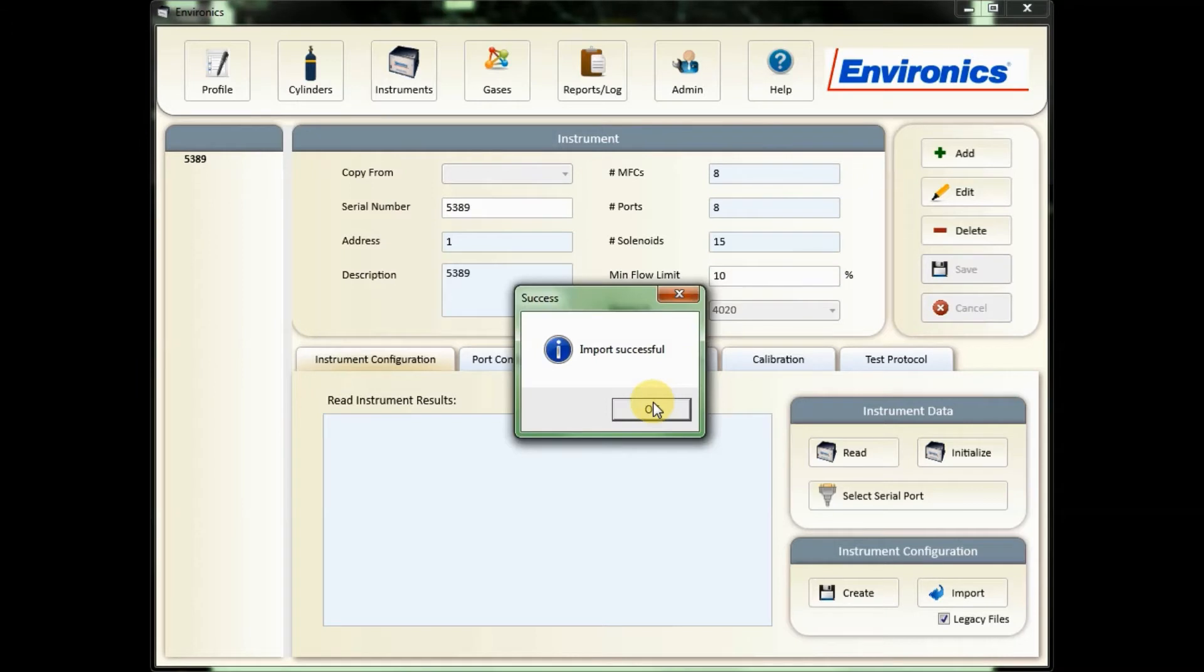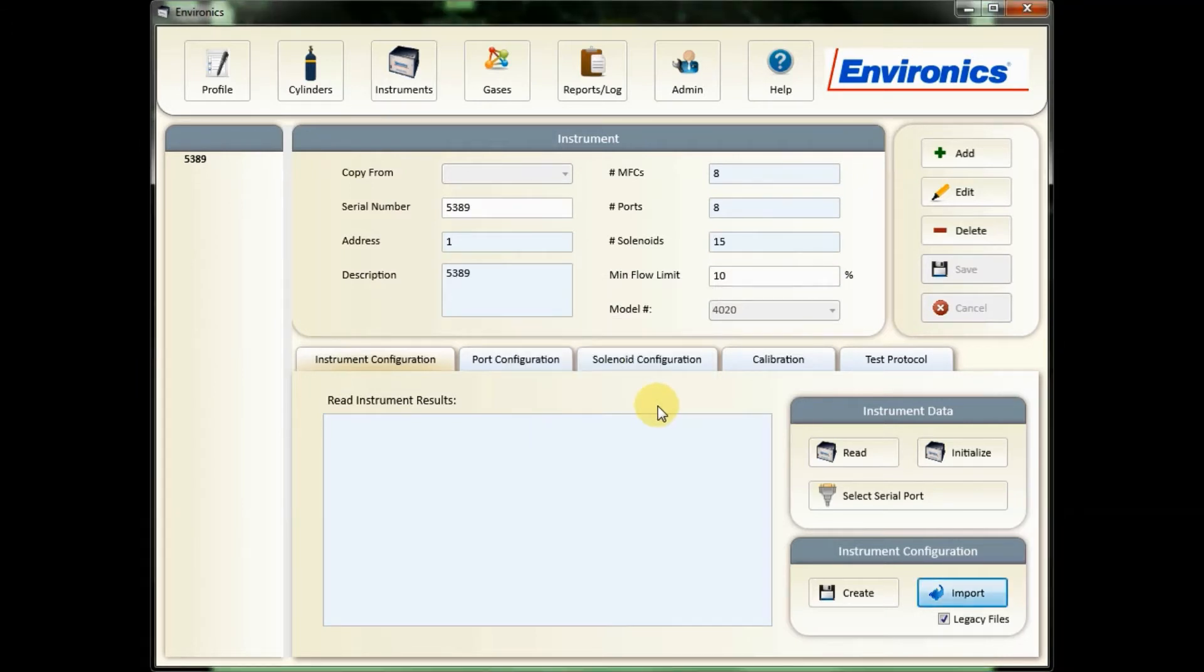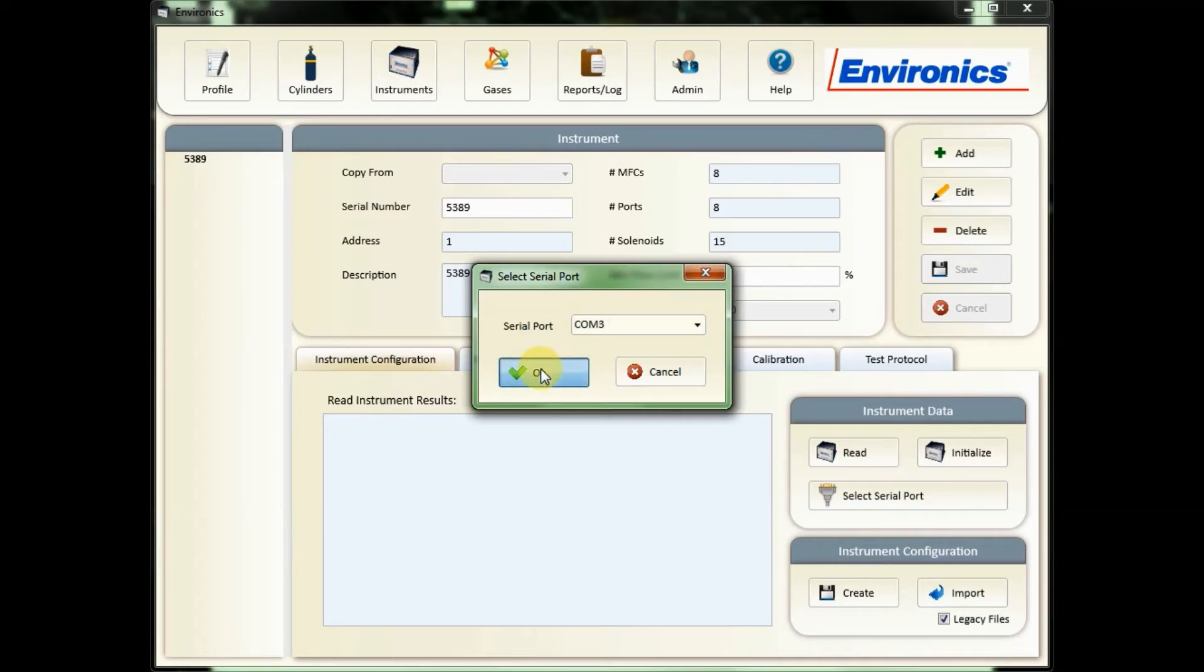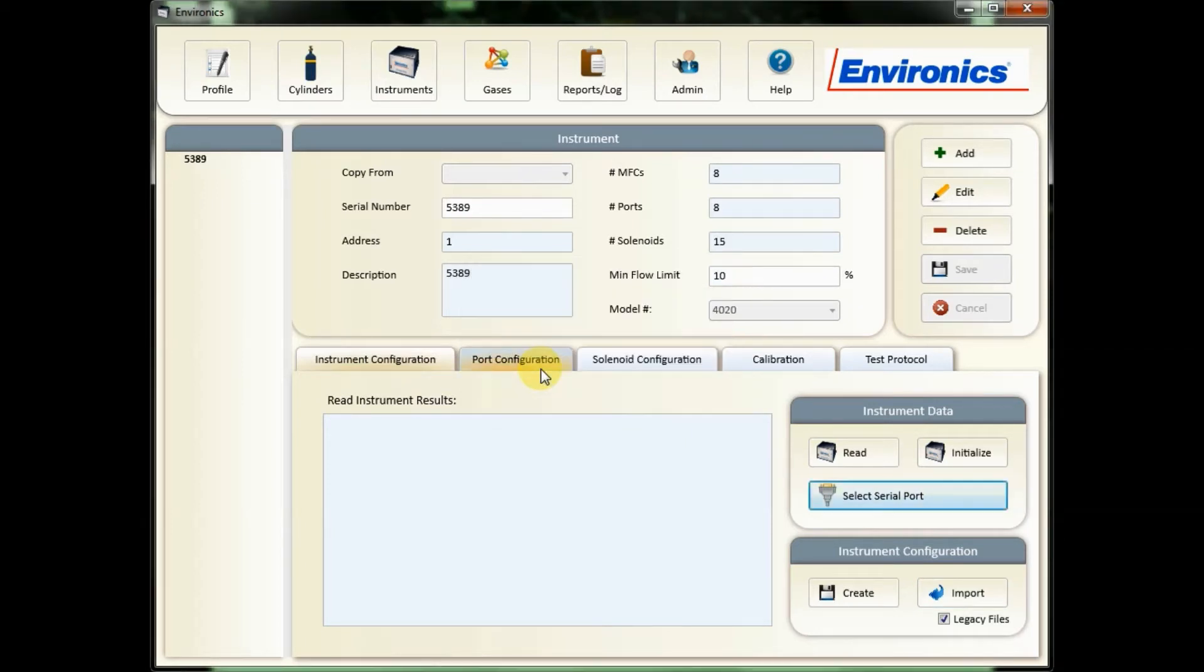The software will then import your data. I'm going to select the serial port that my unit is connected to. That's what that pop-up message was a moment ago.